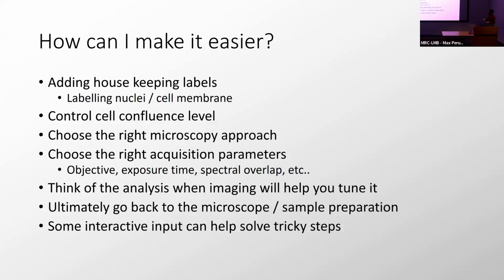And another thing: sometimes we can have analysis where a single little step can be solved manually, and you can save a lot of time, because finding an automated method to do that will take you a week, but maybe in an hour you could have done it with a small interactive step. So you have to find the balance between what to automate and what can be done manually.